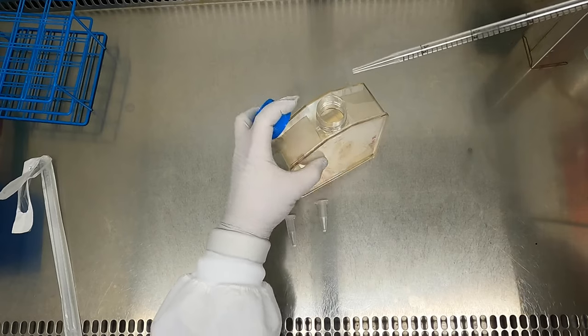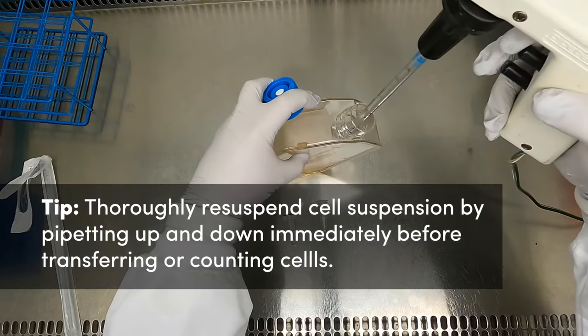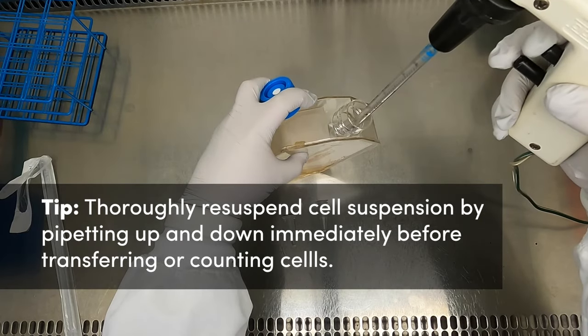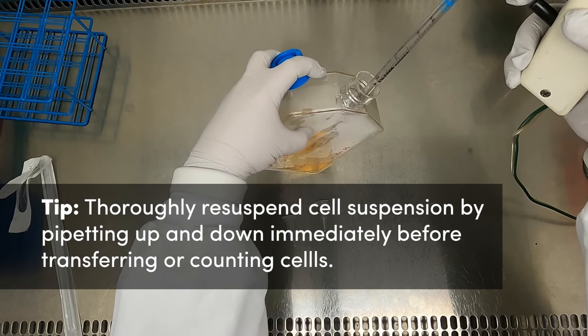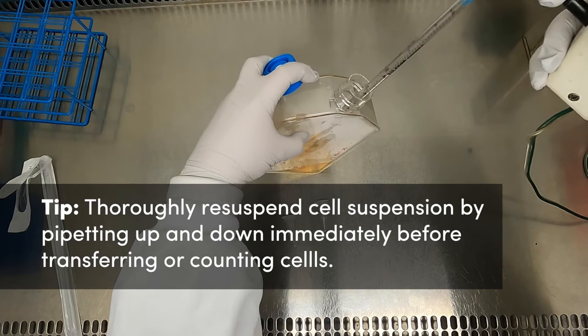Now is a good time to get into our third essential tip. In the absence of shaking, cells and media will start to settle to the bottom due to gravity, even in a short time. Before transferring cells from one vessel to another, pipet the suspension up and down a few times to ensure the cells are thoroughly resuspended and each plate receives a consistent number of cells. This practice will also help the accuracy of your cell counts.